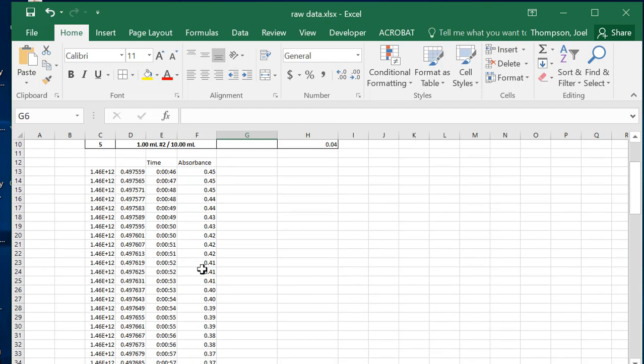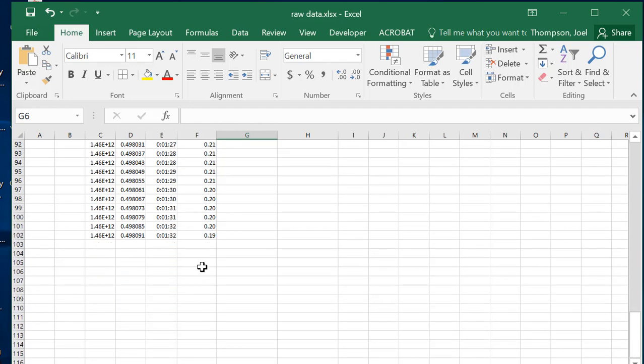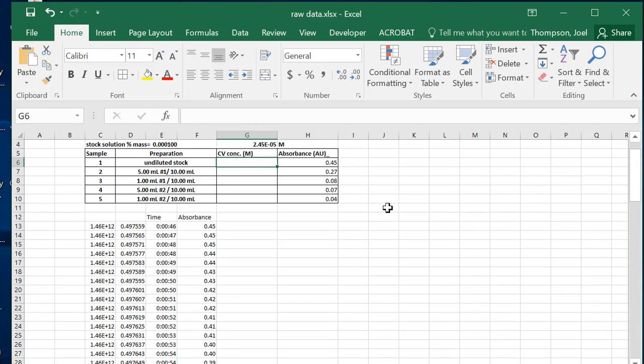The crystal violet is reacting with sodium hydroxide. The crystal violet's going away, and we're going to figure out the kinetics of this. So you can see the absorbance dropping, and we stopped recording data at 0.19. And if you'll look, we're going to set up the calibration well below that. So we bracketed the place in which we're going to run the experiment, so that's important. Now we're going to see if this literally is linear within this range, because maybe this is too concentrated and the molecules start to interact with each other, and that can change how the light is absorbed, or it actually changes some of the refraction properties.